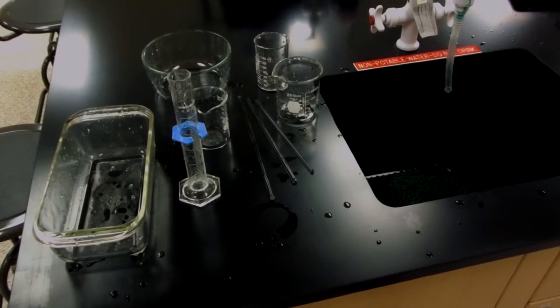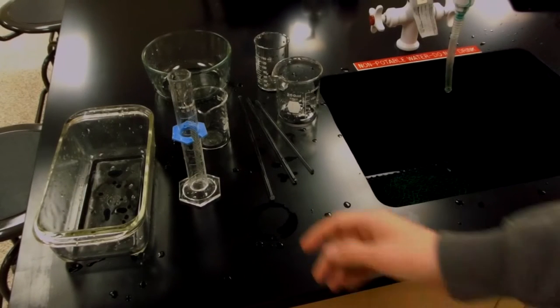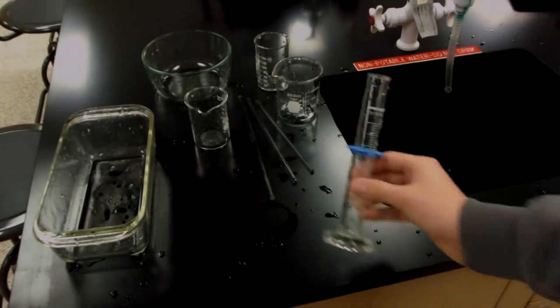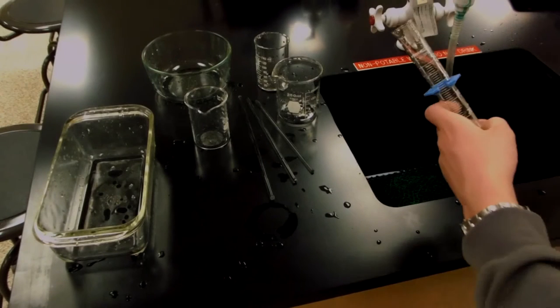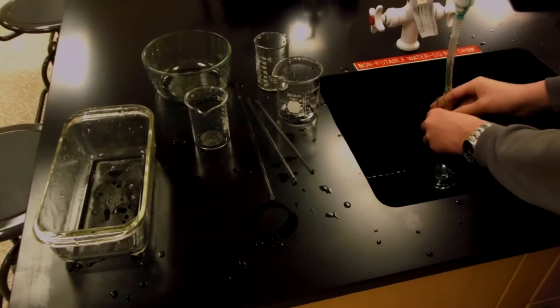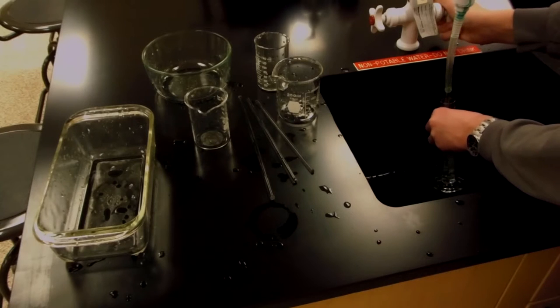So the next step involves washing my laboratory glass. Here I have my two different Pyrex glassware as shown in a previous segment, as well as a couple more pieces of glassware like this graduated cylinder, which I'll wash first. So I will first rinse with ordinary non-potable water, which you would find at the lab.